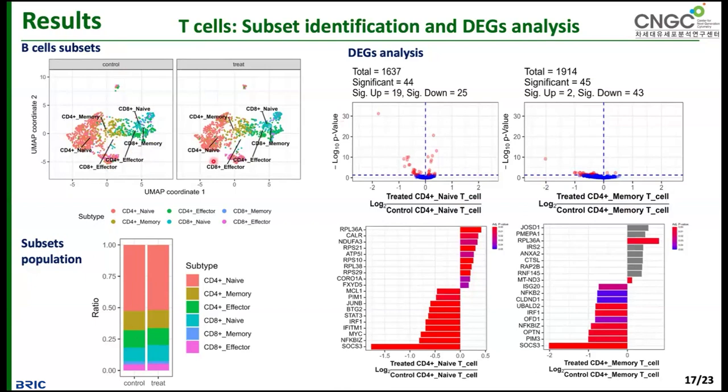Other cell types, we couldn't see any differences in case of other cell types. The purpose of doing the T cell is to identify all different types of subsets, and we can compare individually whether silver nanoparticles induce any toxicity to any type of cell, and whether they cause any significant changes at the gene level or not. Something like that we can confirm.